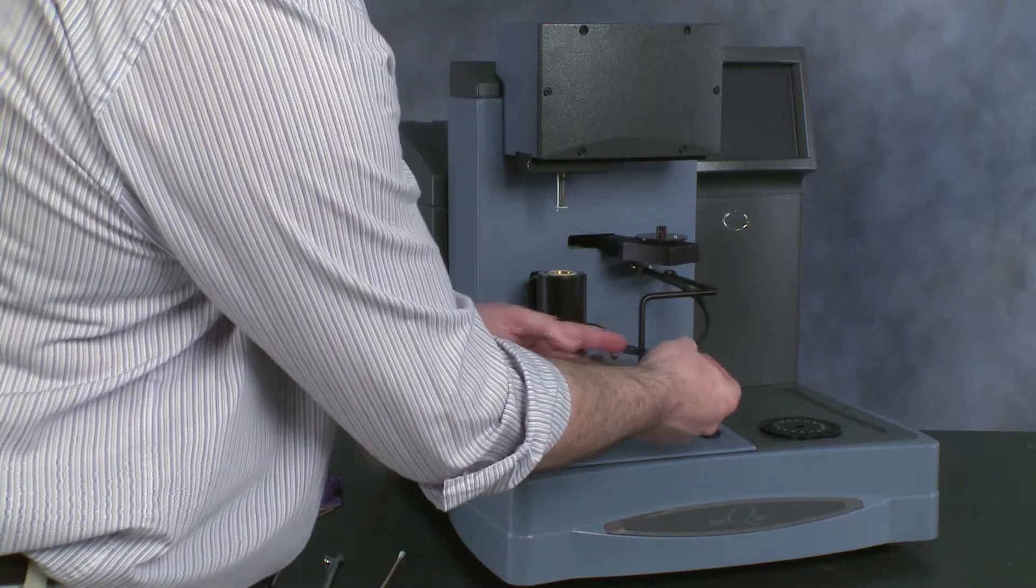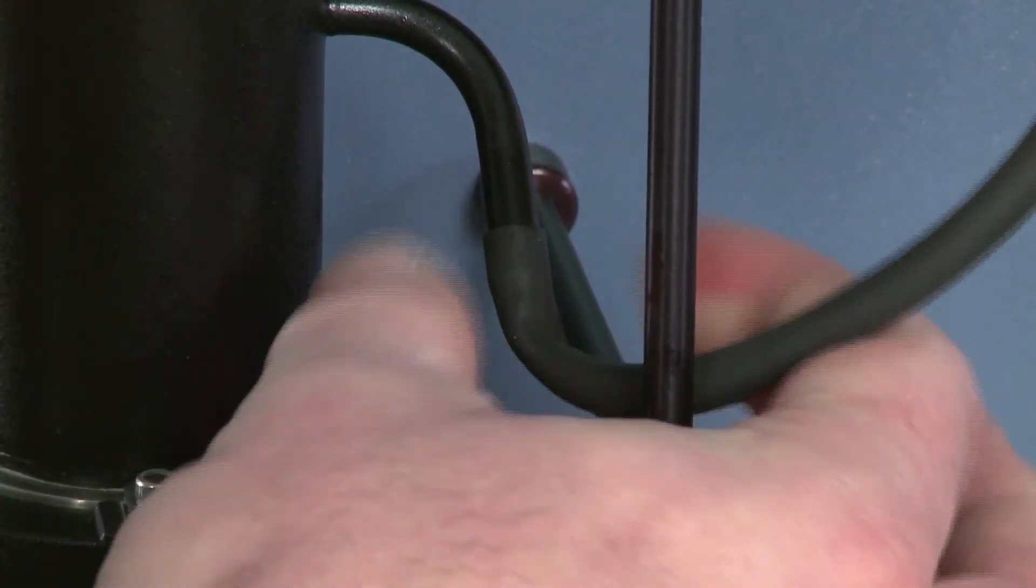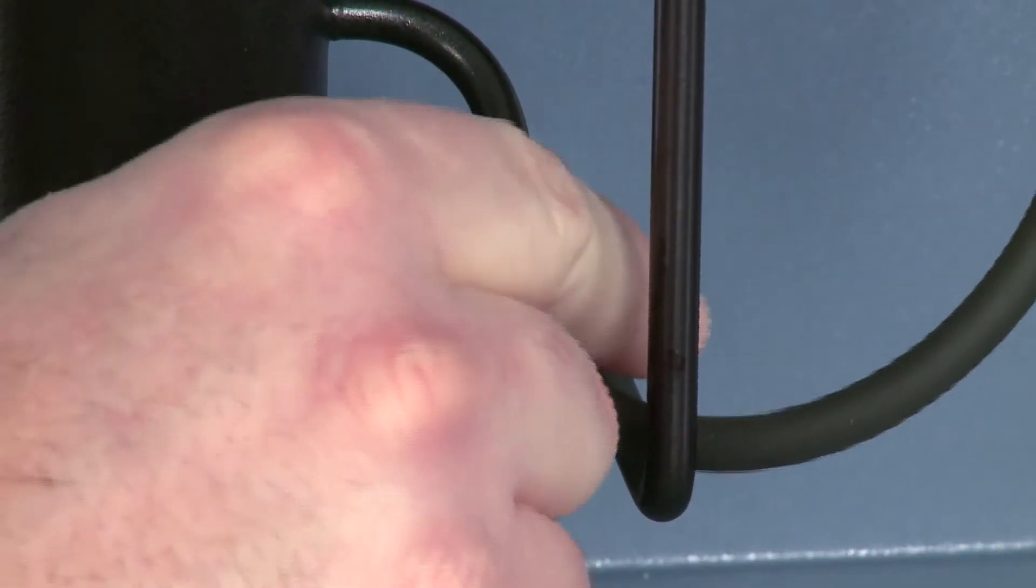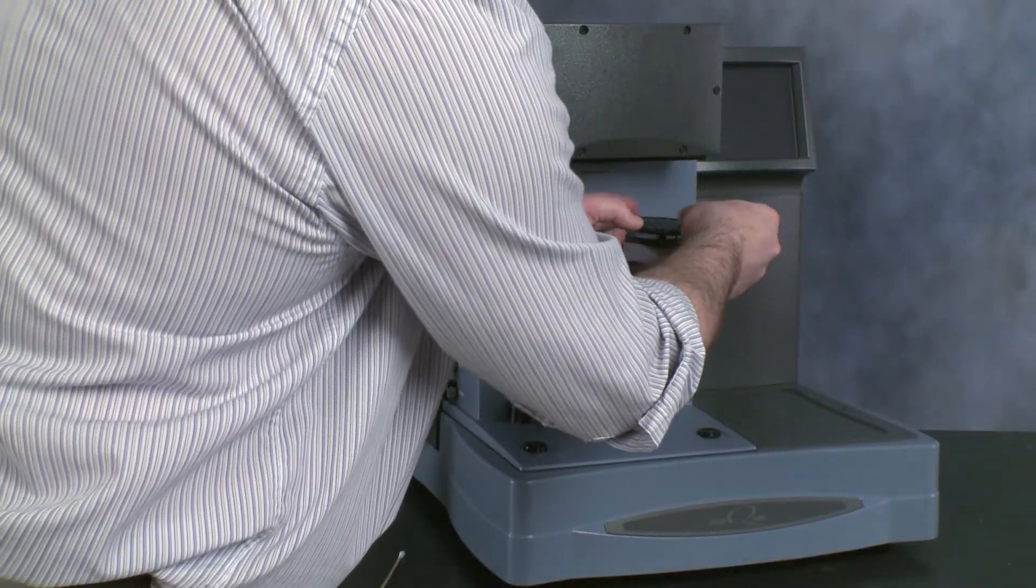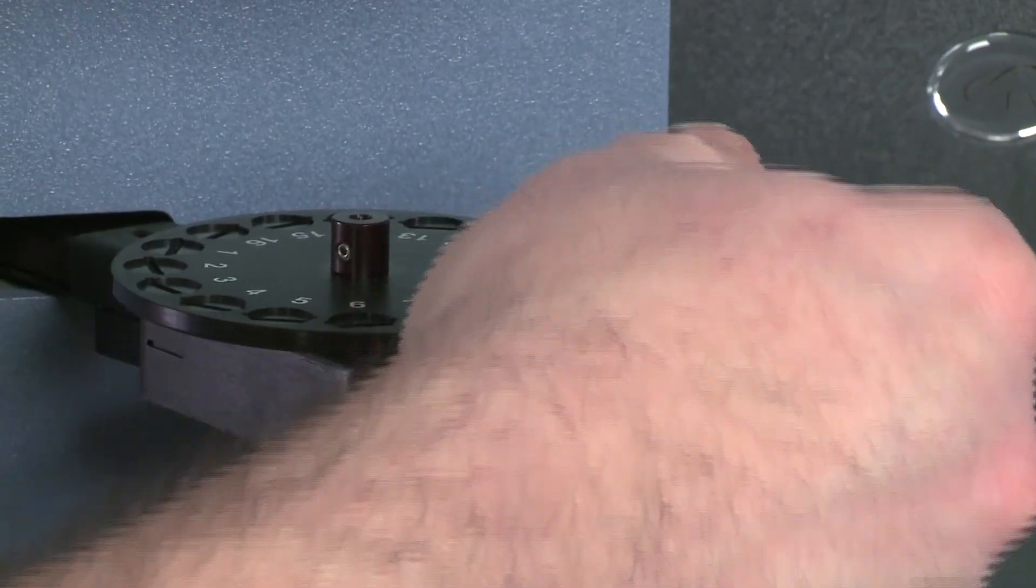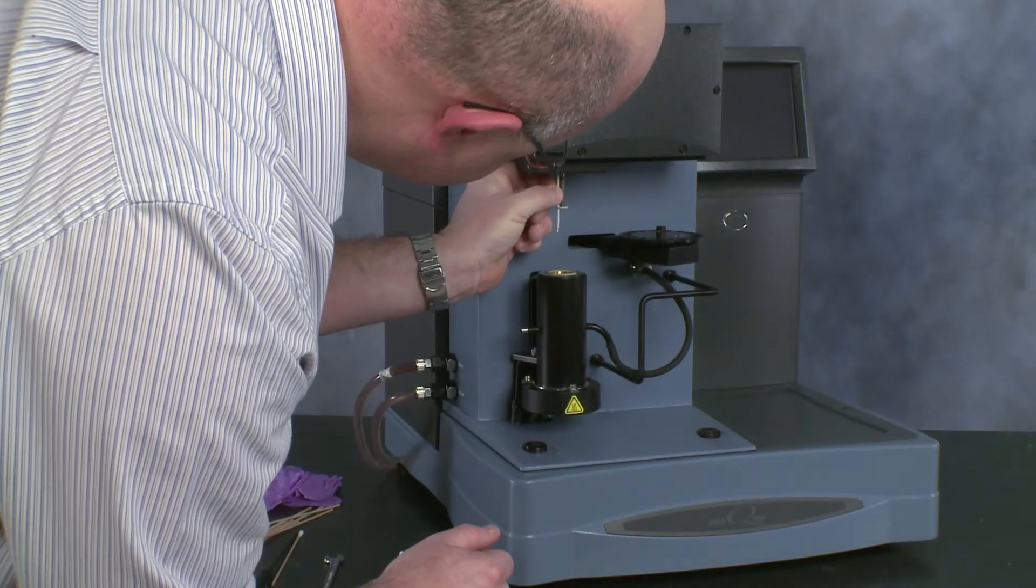We can replace the purge gas tube, making sure to bring it on the inside of the protection so it doesn't get caught. Replace our auto-sampler tray and then lower the thermocouple back into position.